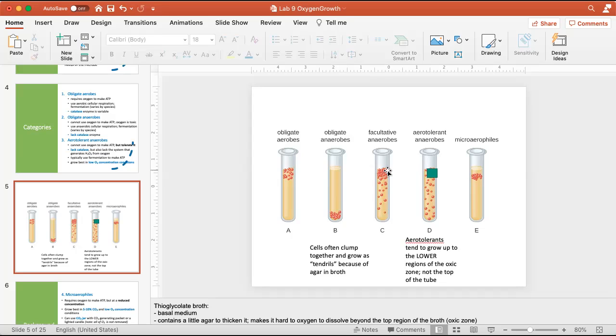And in a tube like this one, what you'll see is a big clump of cells up at the top, and then you'll see these strange little strings hanging down. Those are cells clumping together. Remember, we said bacteria like to associate with each other. They don't like to be all alone in culture or otherwise. So you don't see them nicely and evenly dispersed like this. Instead, you tend to get these weird strings hanging down through the media. Same with this tube.